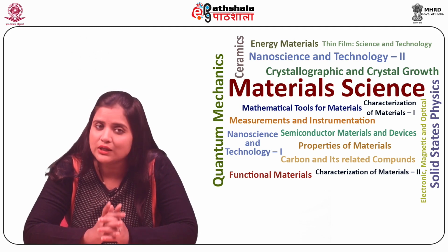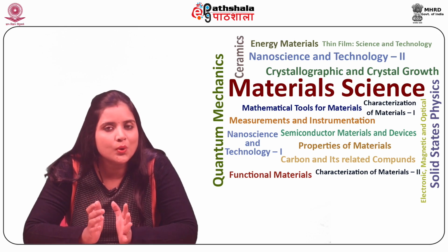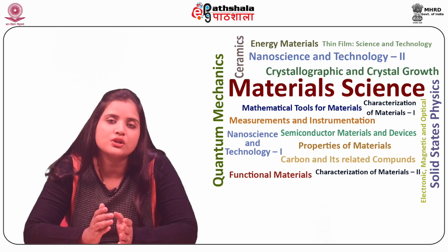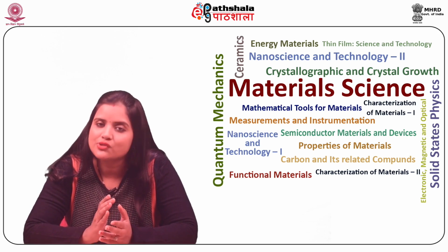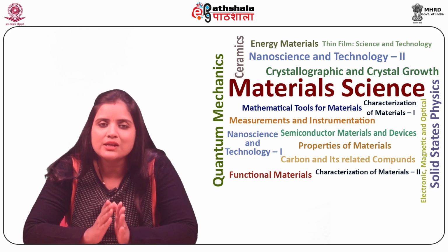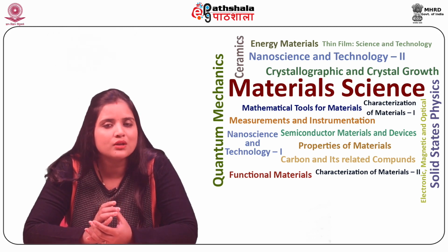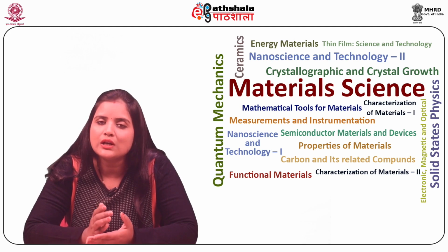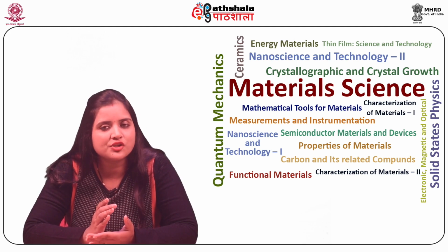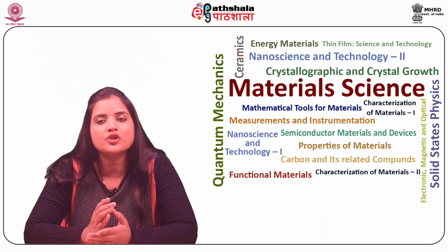Traditional microscopy techniques, not employing a reference wavefront, record only intensity information, while the important information about the specimen is lost. This technique was developed by Dennis Gabor in 1948 while he was improving the resolution of an electron microscope, wherein the correction of aberrations in electron imaging lens became a critical technological challenge.